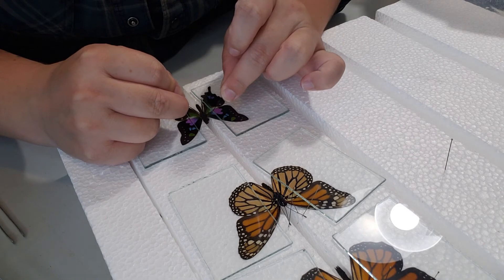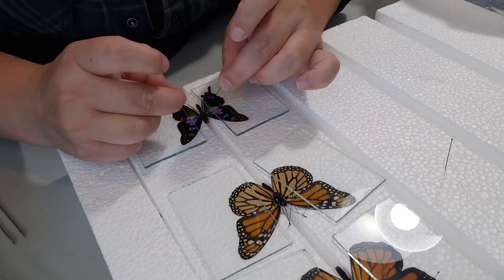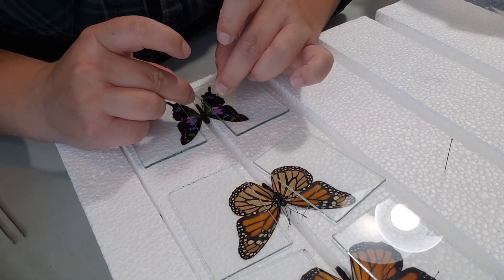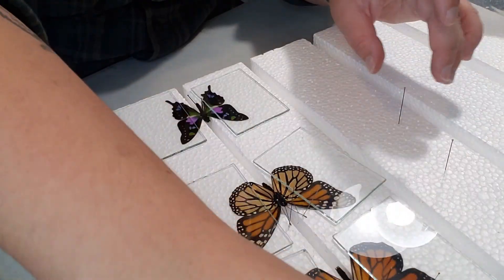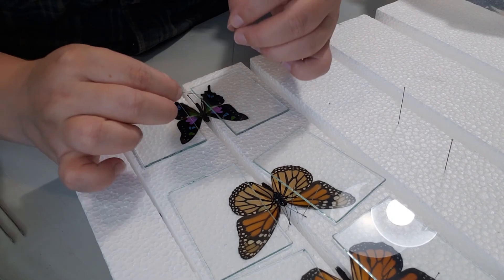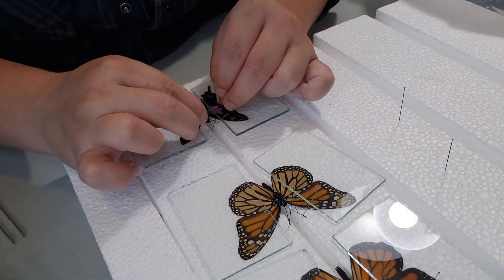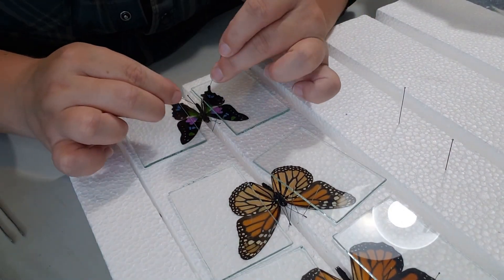Do the same thing for the other side — slowly lift up one side of the glass at a time. If you did the top wing first and you're moving to the bottom wing, slowly lift the bottom side of the glass while keeping the top side in place so the top wing doesn't fall down. Then straighten out the abdomen and thorax with pins, and straighten out the antennae as best you can.